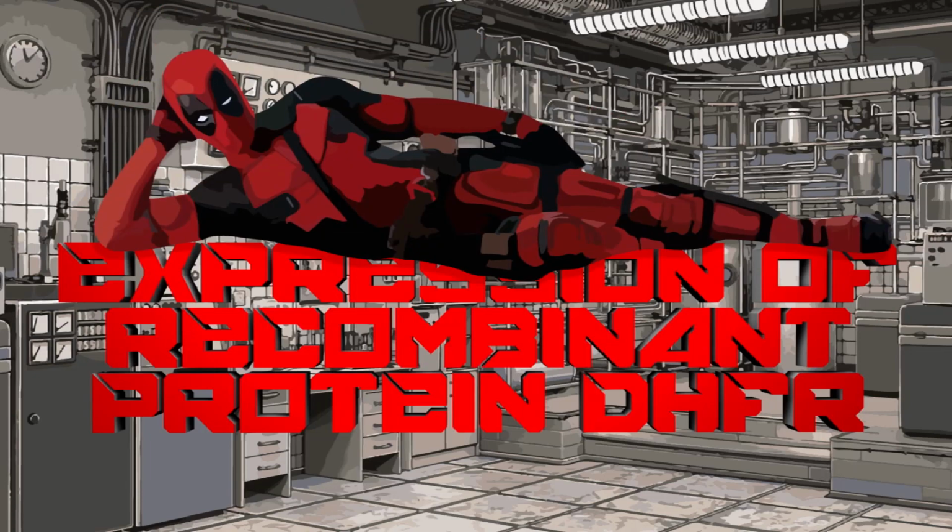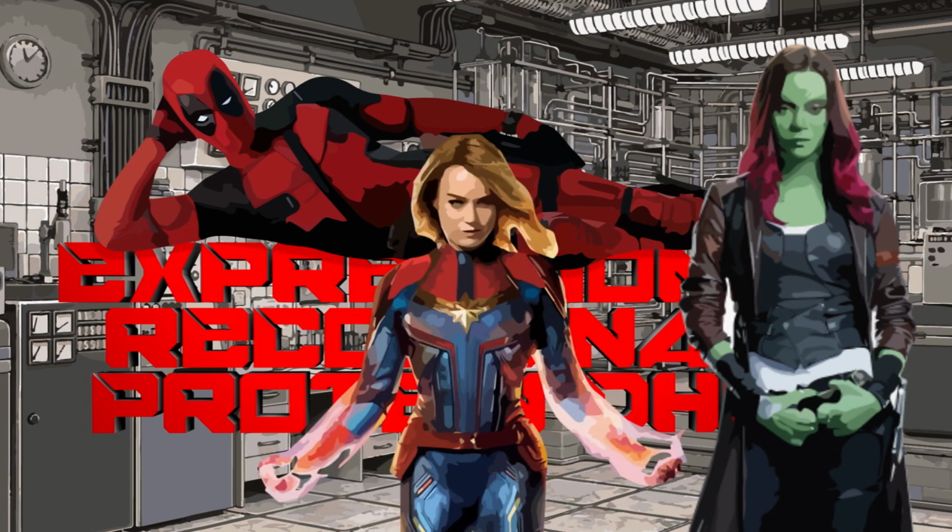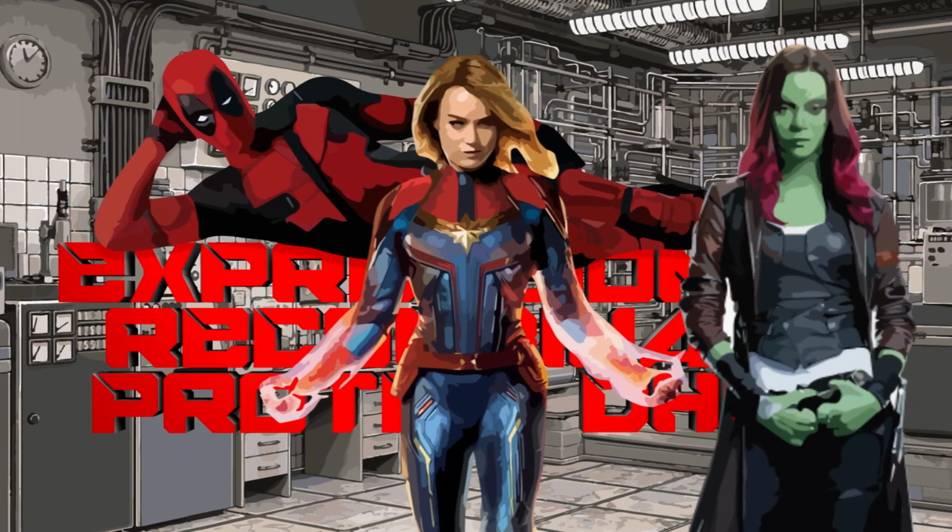Today we will be talking about expression of recombinant proteins, specifically DHFR. The goal of this lab is to induce the expression of the DHFR protein and grow it in order to comprehend its biological role in a laboratory biomedical environment.